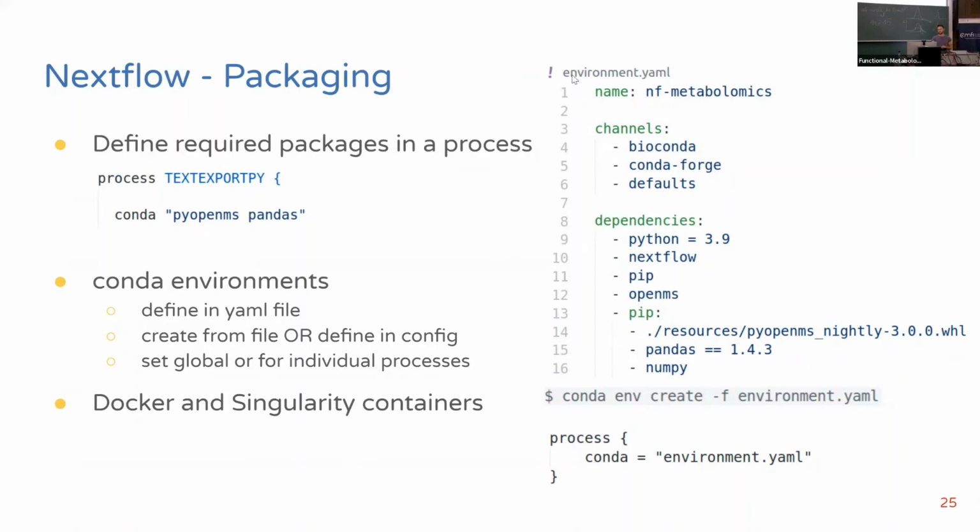You can define also globally in an environment YAML file with all the dependencies that you need. You could do that here, or you could set it in the config file as well. And besides Conda, Docker and Singularity containers can be used in a similar kind of way.